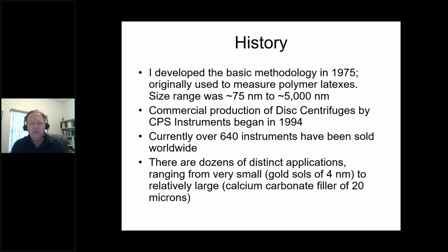With that requirement, we began to think about how we could do this with sedimentation by Stokes' law. And we naively built a hollow disk, filled it with water, and expected we could inject the sample and get wonderful results. And of course, it didn't work at all. It took a couple of months of effort to begin to understand why it didn't work. And the breakthrough that came there was the requirement for a density gradient to get a stable sedimentation. And we'll talk about that in some detail.